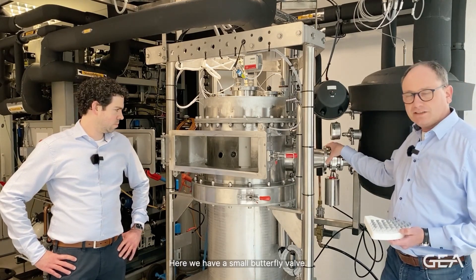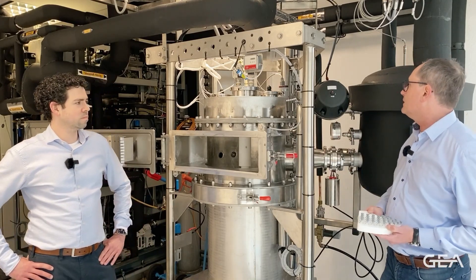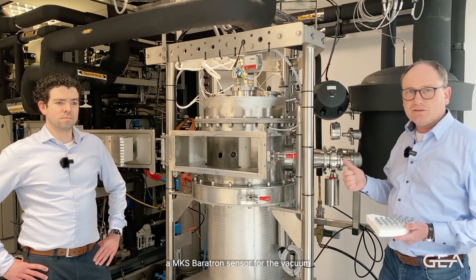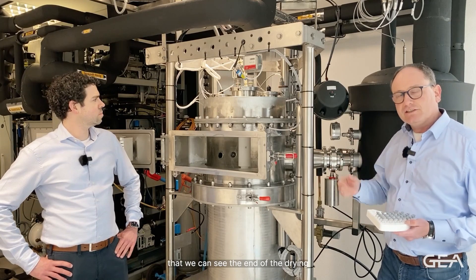Here we have a small butterfly valve — this is a valve between the chamber and condenser. We also have for this kind of equipment a baratron sensor for the vacuum, and also a pirani so that we can see the end of the drying.